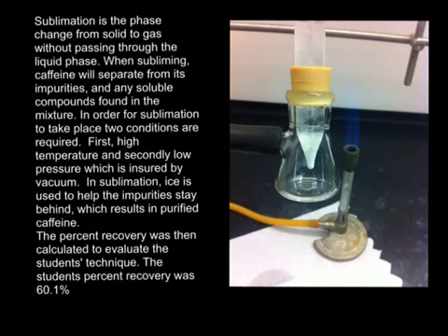Sublimation is a phase change from solid to gas without passing through the liquid phase. When subliming, caffeine was separated from its impurities and any soluble compounds found in the mixture. In order for sublimation to take place, two conditions are required. First, high temperature, and secondly, low pressure, which is ensured by vacuum. In sublimation, ice is used to help the impurities stay behind, which results in purified caffeine.